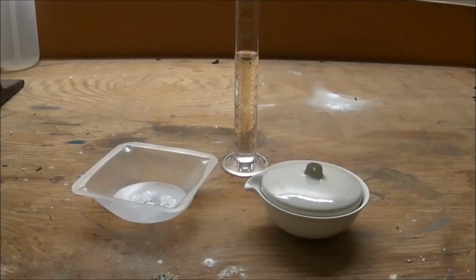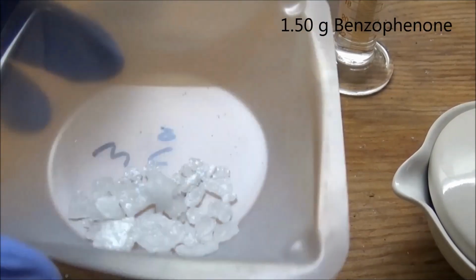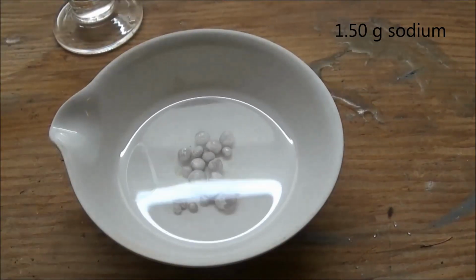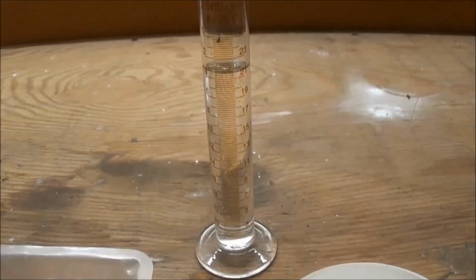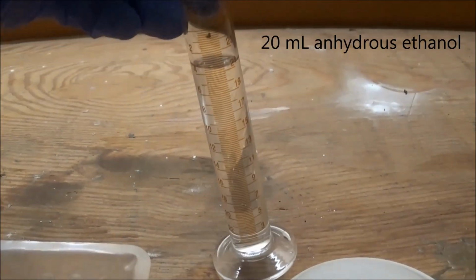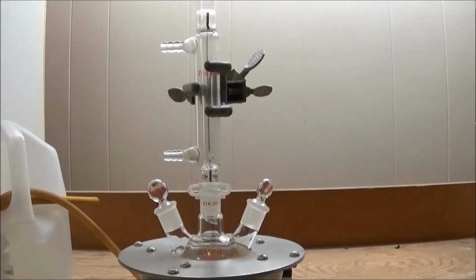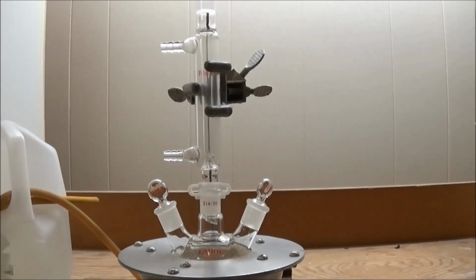The three main chemicals used are 1.5 grams of benzophenone, 1.5 grams of sodium metal, and 20 milliliters of ethanol. The setup I'm using consists of a 3-neck round bottom flask with a Liebig condenser.